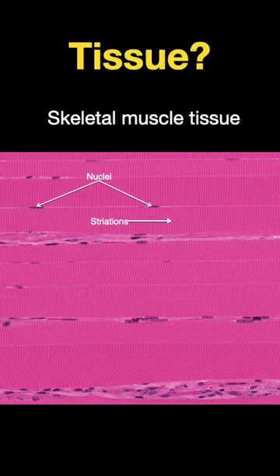What tissue is shown here? The answer: skeletal muscle tissue, because you can see the striations.